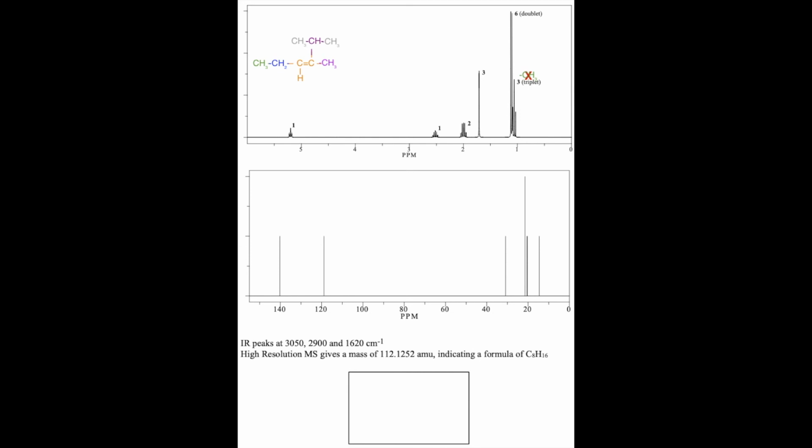And then I'm just going to march through the entire structure and look at it, comparing it to the Proton NMR. So starting on the far left with this green methyl group, that's very generic, right? It's not bonded to anything electronegative. It's not pi bonded. So those 3 hydrogens will be coupled by the neighboring 2 into a triplet. So I should have a generic looking CH3 triplet. And I do. I put a big X to it right over here.